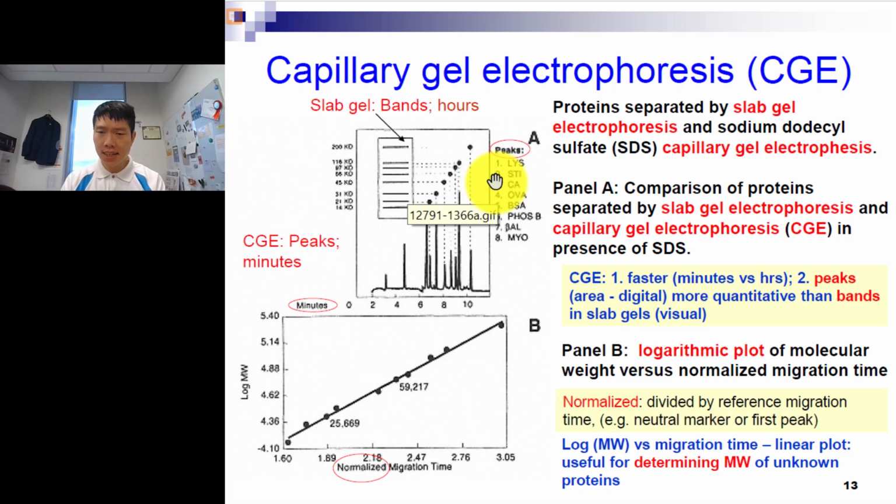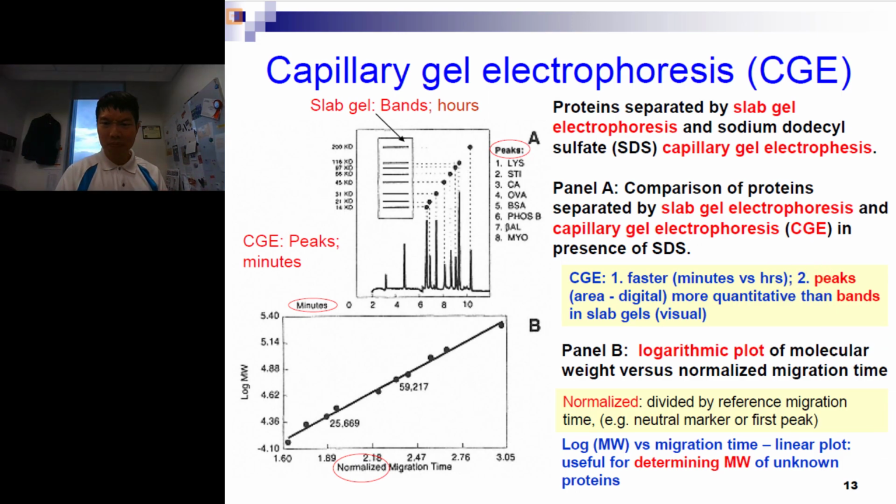It's not as high as CE in capillaries. And hence the separation time is very, very long, typically many hours. That means the analytes are separated into bands rather than peaks, because you can't separate them so easily. And hence it's also not accurately quantified. It can be done by integrating the areas under the peak, but not so easy.